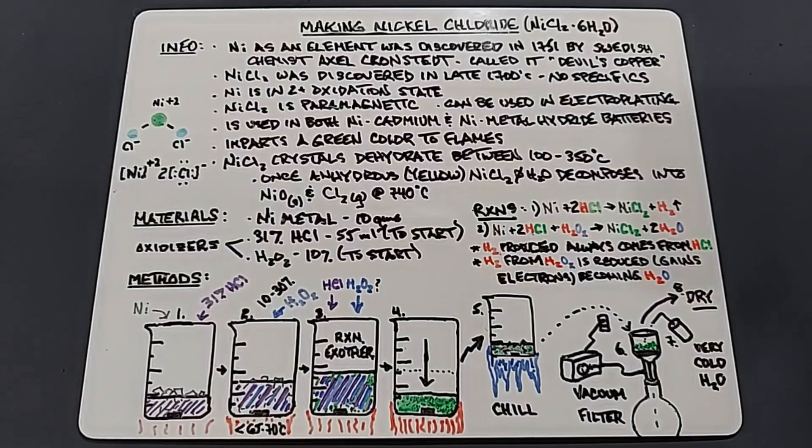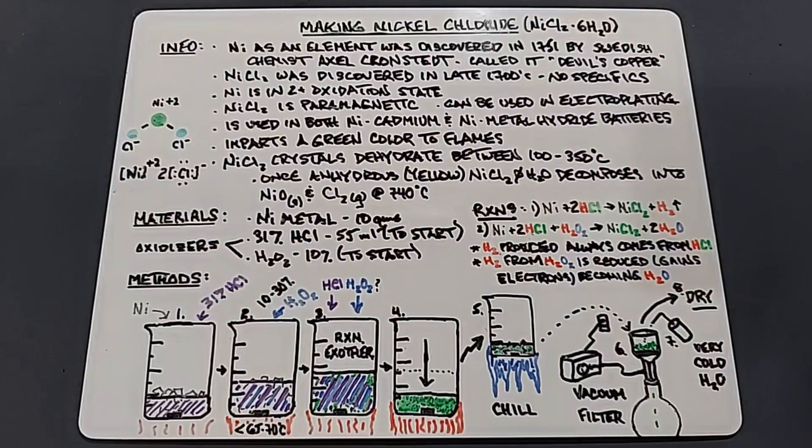In anticipation of making a future video on nickel plating, I need to make both nickel chloride and nickel sulfate.